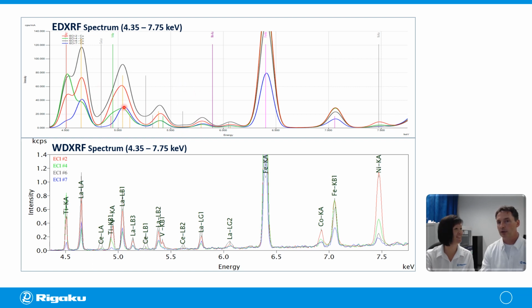Here I have difficult. It's only 4 samples. Just 4. It's okay. I'm going to redo that. Why do you have to do that? I'm sorry. You get the same 5. Like, I'm not going to redo it. I was going to redo this. This is live. What can I do?